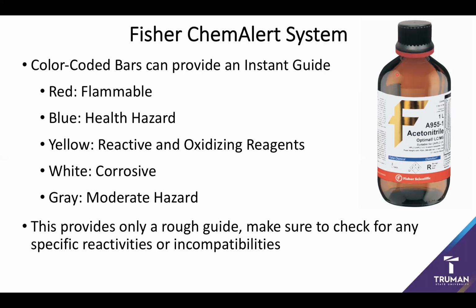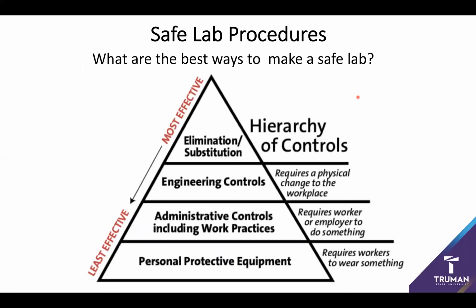And so even if the label has been pasted over, you can't always trust the ring because it may have belonged to the last chemical in that bottle.